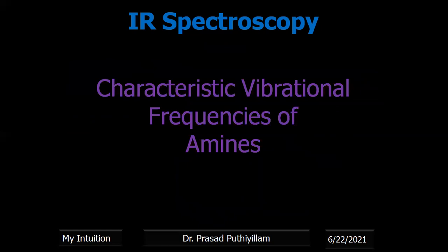Remaining analysis of ethers is somewhat difficult, because the obtained peak values will match with the absorption frequencies of many other functional groups also.